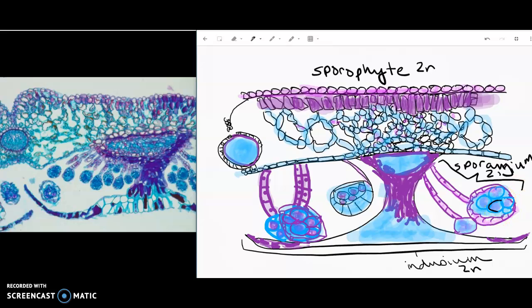However, inside the sporangium, meiosis has taken place, and so the spores are haploid. And then the annulus, that is part of the sporangium, so it is also diploid. Okay, and that's going to be this entire ring of cells around the outside here, kind of a little jacket.